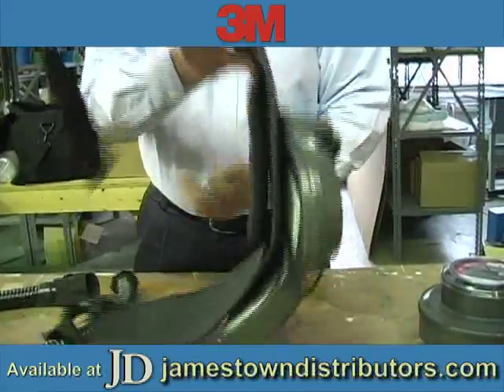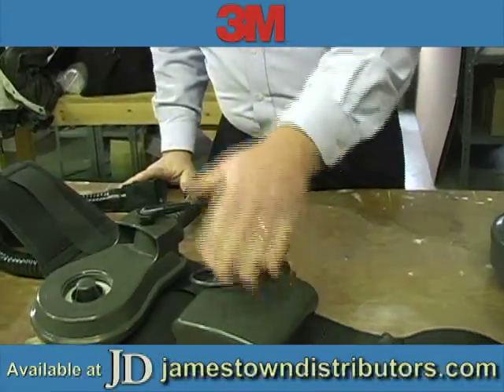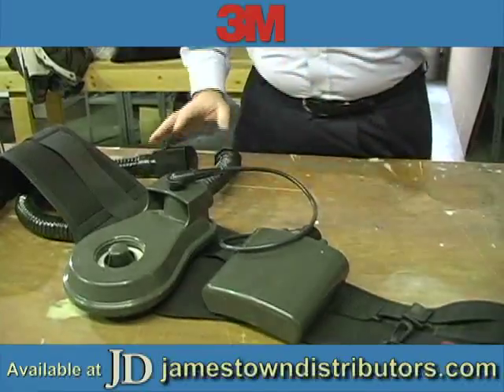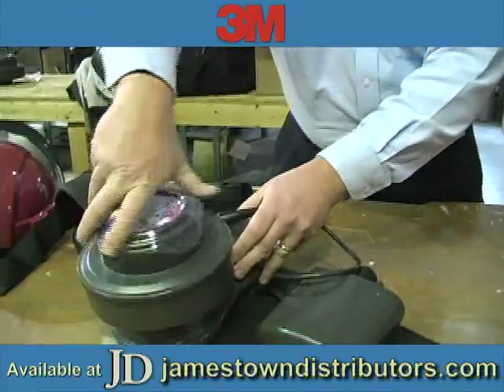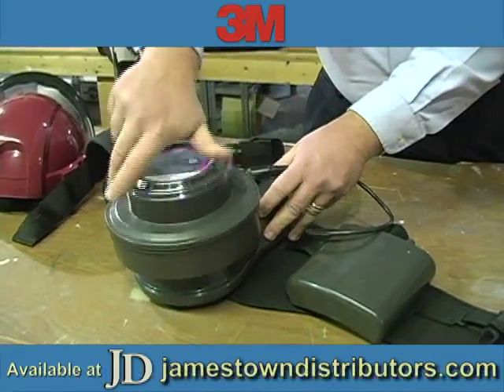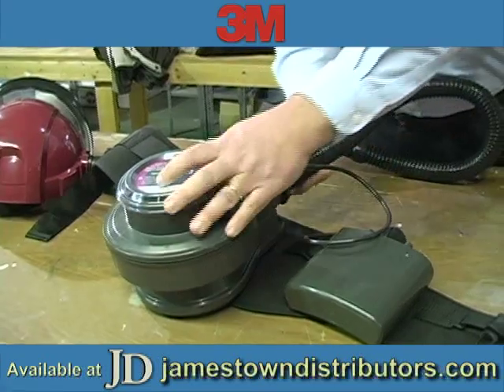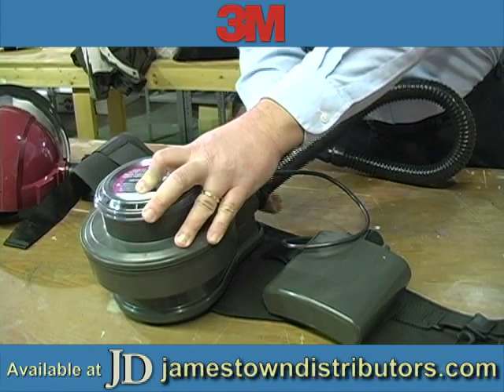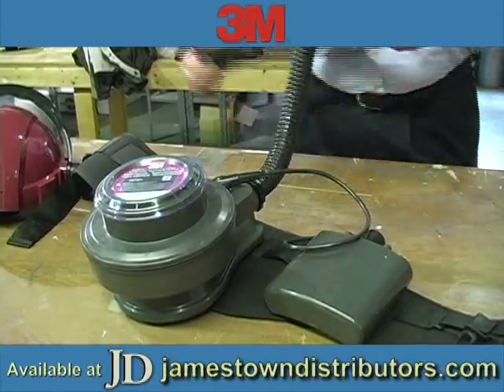We have the belt and rechargeable battery, which powers the motor. Onto the motor is the cartridge through which the air is filtered. The motor pulls in the air through the filter, and that air is then delivered to the helmet through this hose.